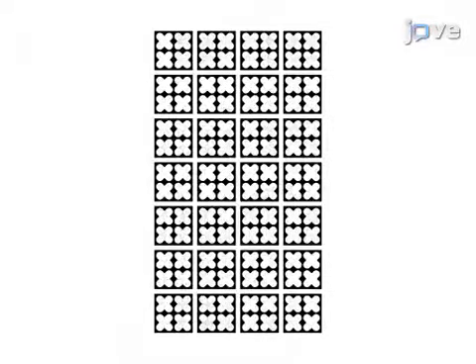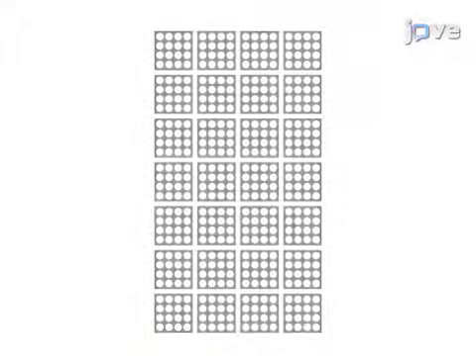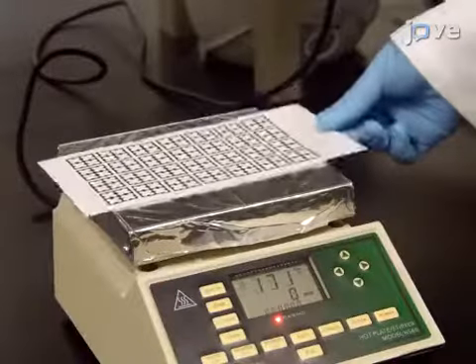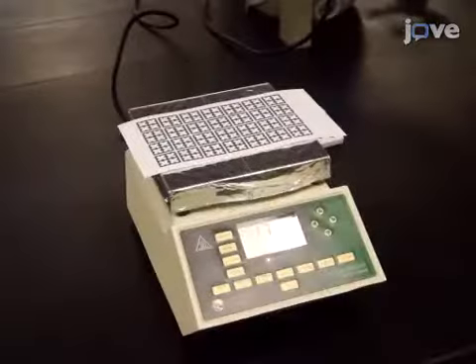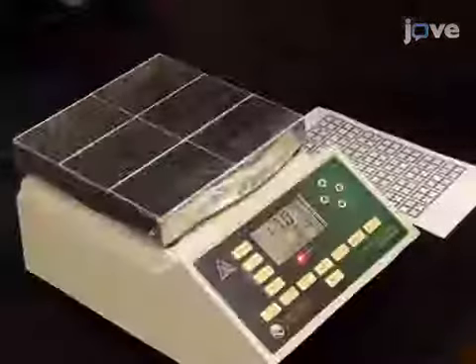First, print an array of each layer for the device onto filter paper using a solid ink printer. Place each filter paper on a hot plate at 170 degrees Celsius for two minutes to melt the wax-based ink and allow it to fully penetrate into the paper, forming hydrophobic barriers.